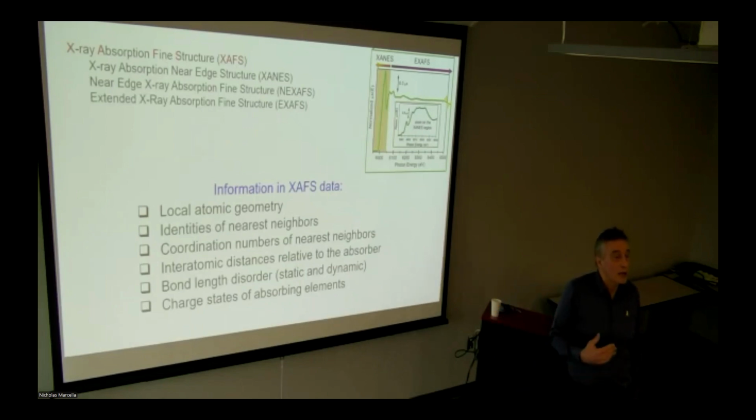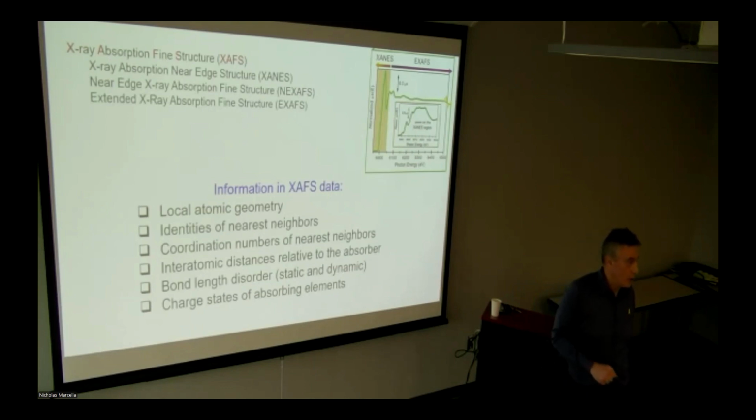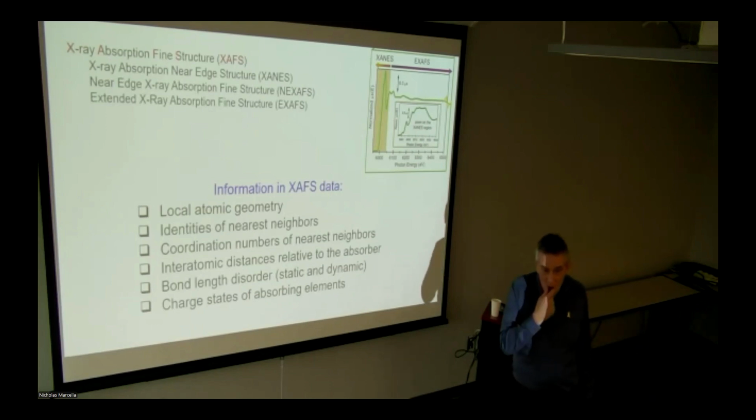We already discussed why I know about the distance. Because of the interference. Interference is connected to the distance. What is connected to the coordination? What property of the signal is connected to the coordination? Yes. Probably the amplitude. The amplitude. Why? Because each one gives you the peaks, because they interfere, right.